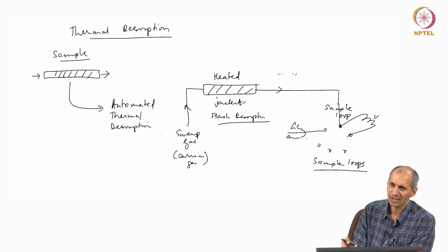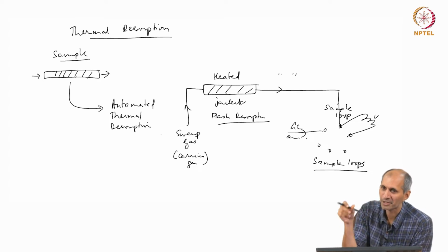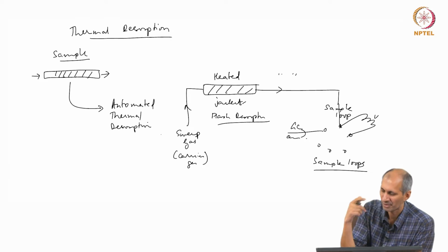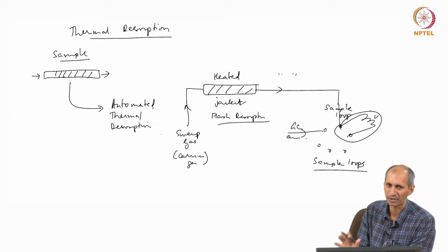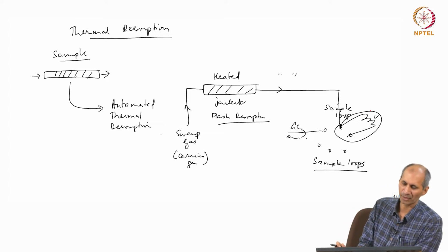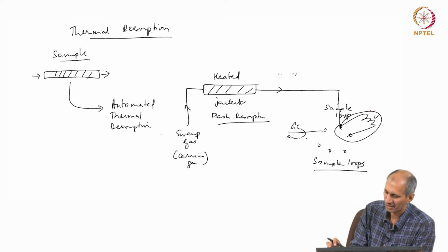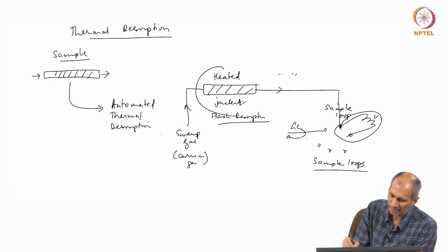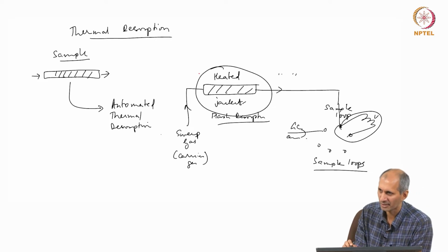When you are doing ATD, you have to calibrate like this, which means that I have to inject a known concentration of gas. Calibration now becomes very, very difficult, because if you are calibrating a concentration, you have to do it in the context of this setup. So, you have to make some adjustments to your calibration. If you want to use an older calibration, you have to make sure that it corresponds to this. But the idea here is you are now eliminating one manual processing step. You are automating everything, so that your hope is that things are consistent.